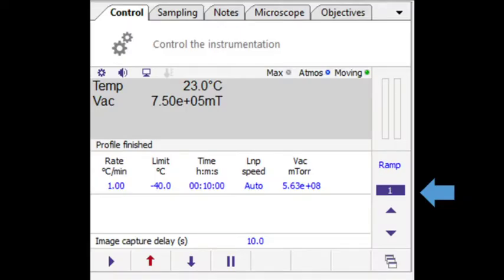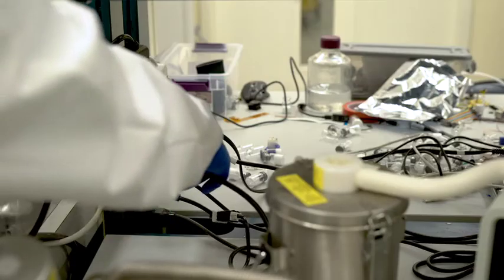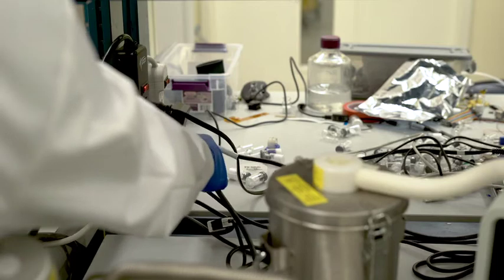Start process. Cycle the recipe indicator to step 1. Press the start button to begin the process.